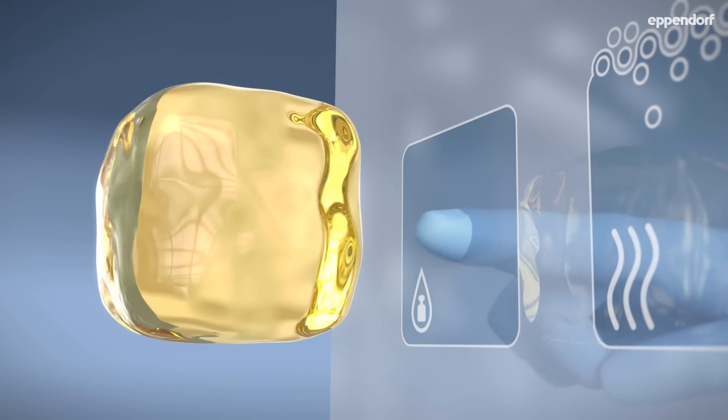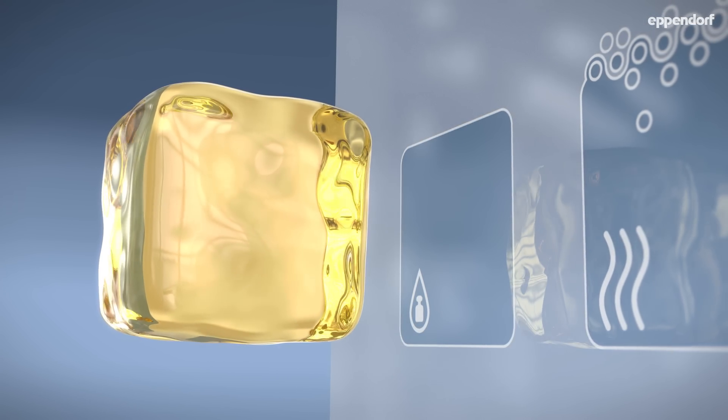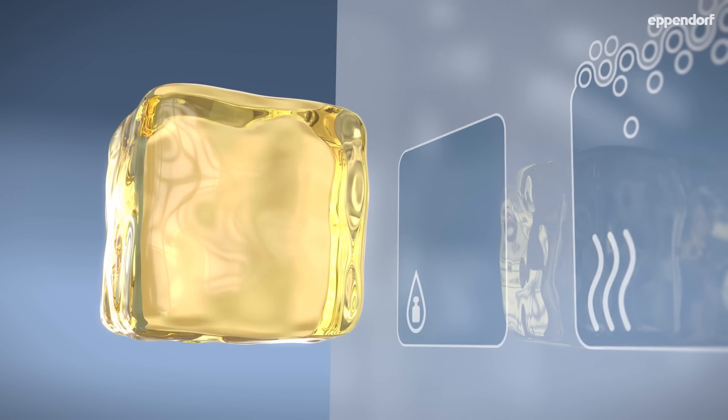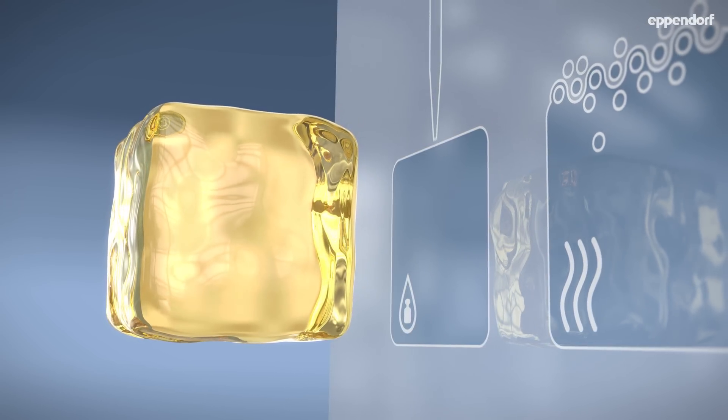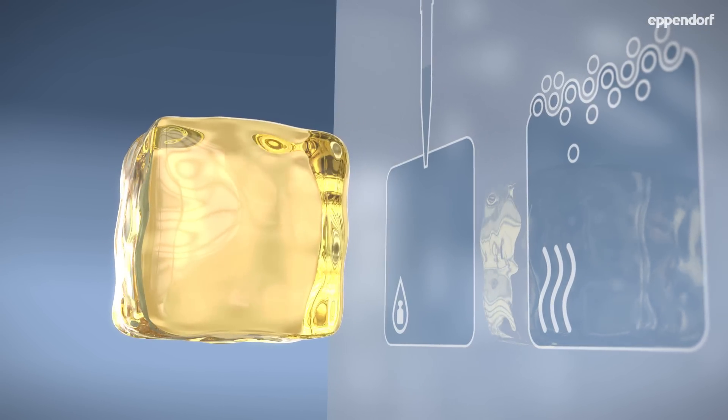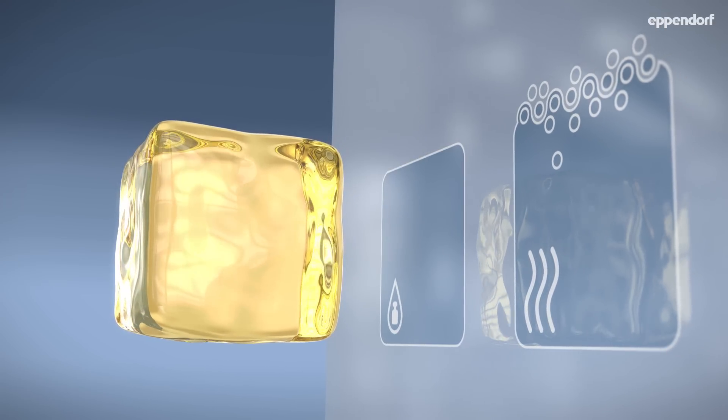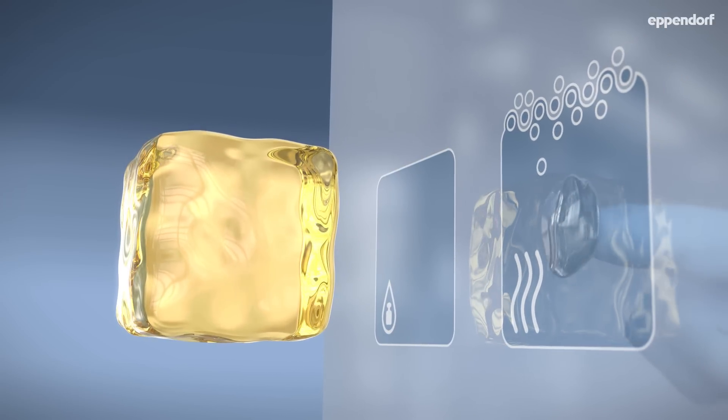The first category is viscous liquids. These liquids do not flow as easily into or out of the pipette tip. If you use an air cushion pipette, be sure to pipette slowly and use reverse pipetting. Using a positive displacement dispenser is an even better way to deal with this problem.